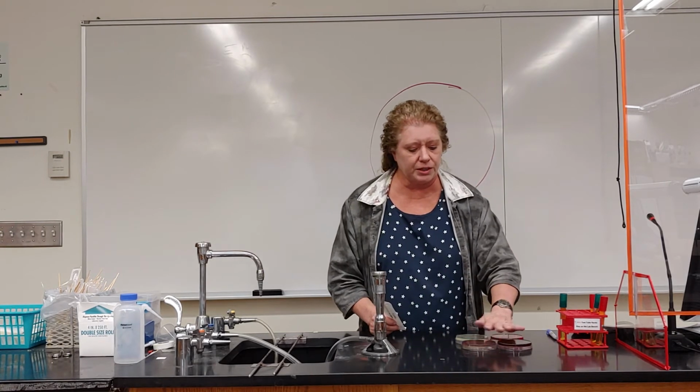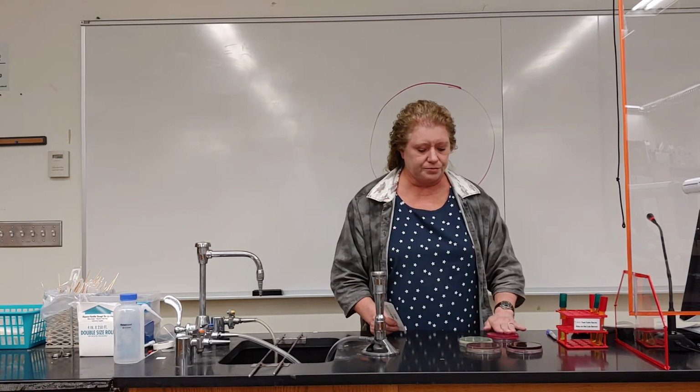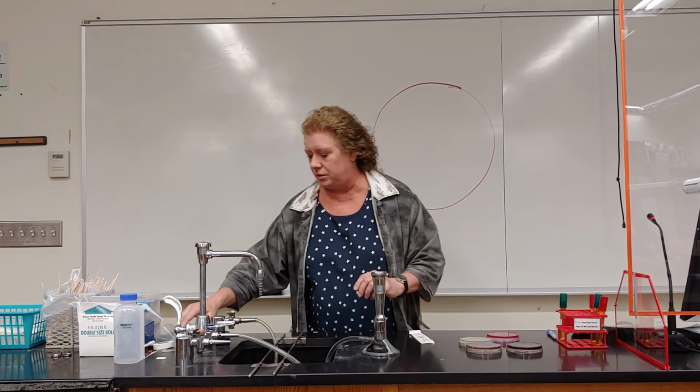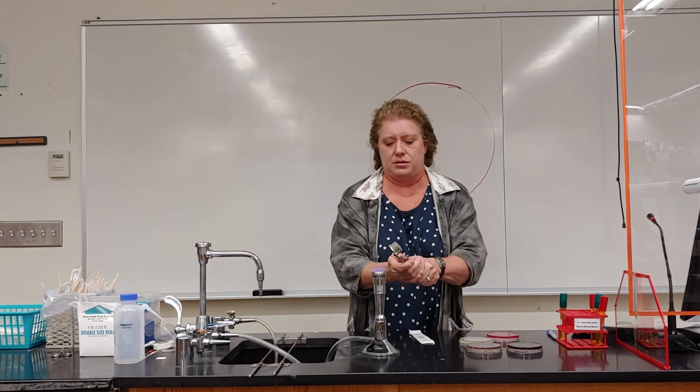So you have all your plates labeled and ready to go. You're going to need your Bunsen burner lit, so go ahead and light that.